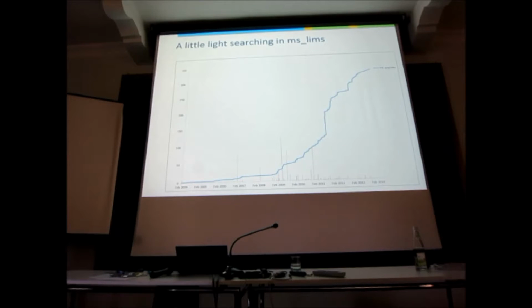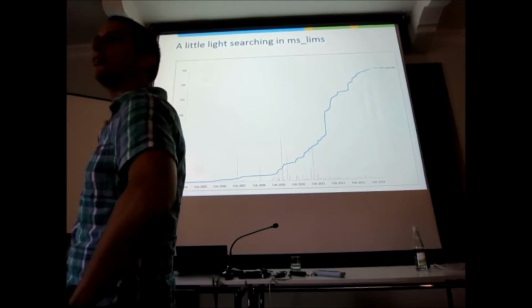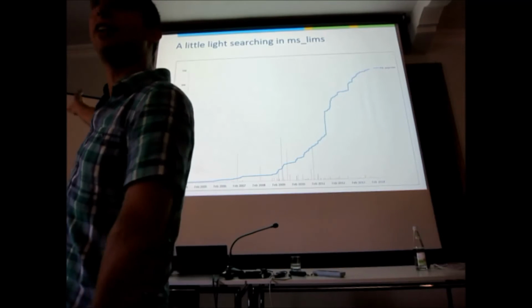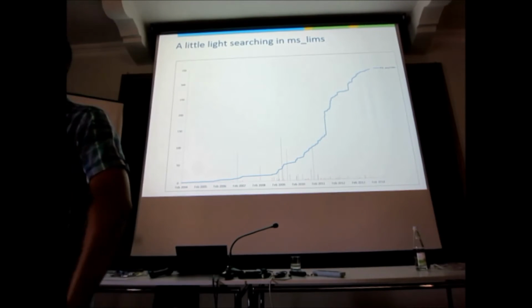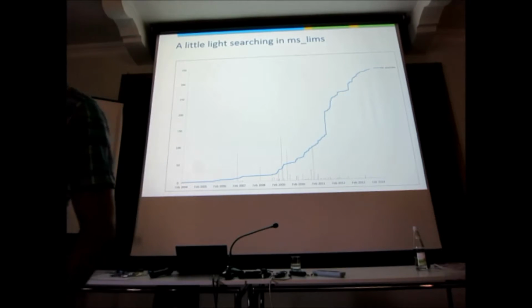I was in South Africa teaching a course with Catherine Lilly, and Catherine Lilly said, yes, and this peptide is very interesting because it contains my initials, Catherine S. Lilly, KSL. And there are very few peptides with KSL, so I make a VPN connection to Ghent quickly. I do one query on my database, and I say, oh, Catherine, this is through time, all of the peptides we have ever found that contain KSL, cumulative, and the number of spectra in each of the different runs in which we found it. And I got that like that, okay? This is a whimsical example.